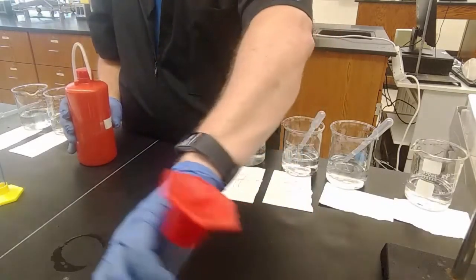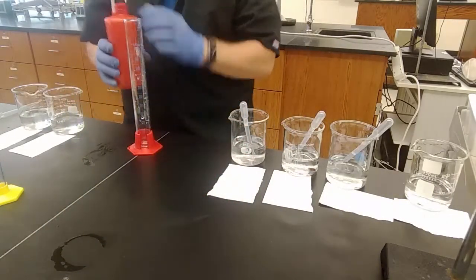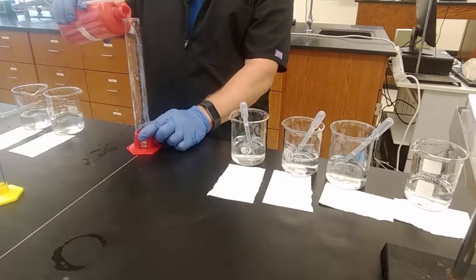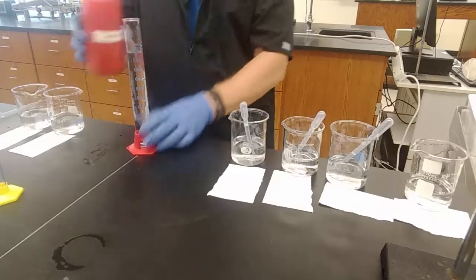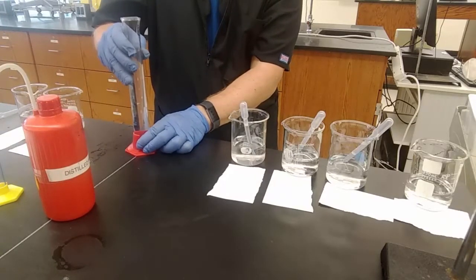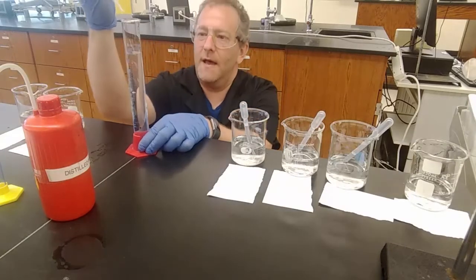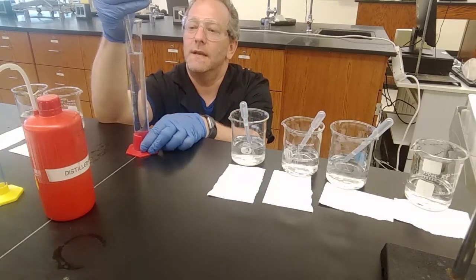Because this is the one where we're doing a 1 to 99 dilution. Air bubbles. Eye level. Down to 99.